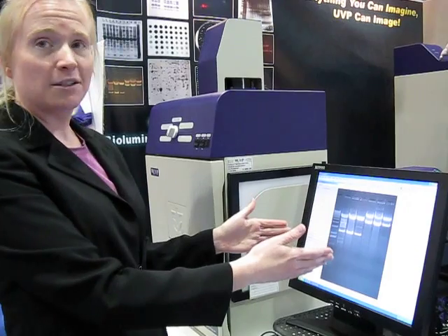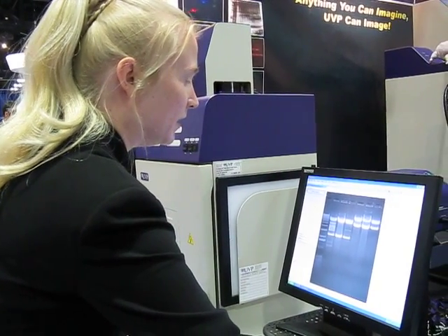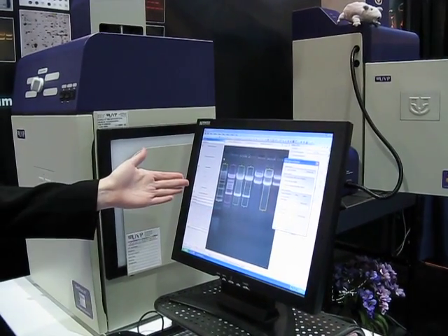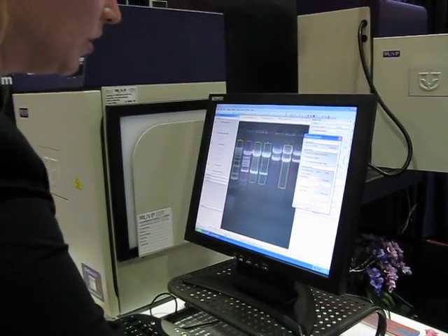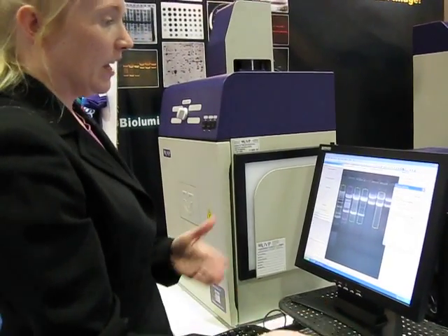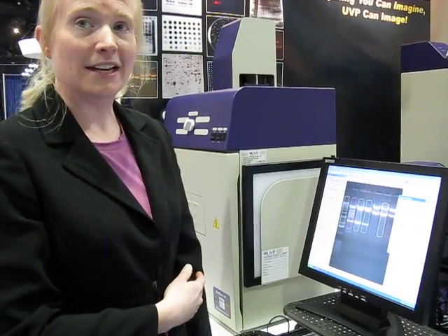If you want to find your lanes and bands within that gel, you simply go to the 1D Analysis plugin. You select Find Lanes and Bands — see how easy that comes up. You've seen that it's capturing all of your lanes and your gels as well. You can also change your sensitivity to add lanes if necessary, and you can also add bands as necessary.